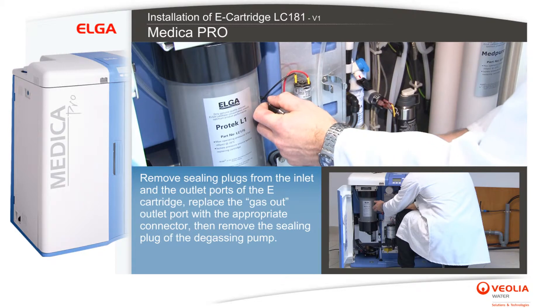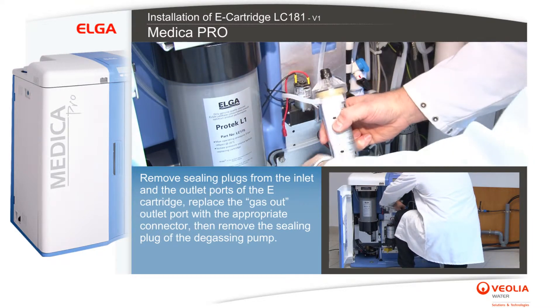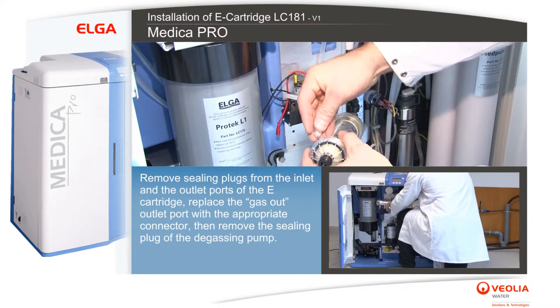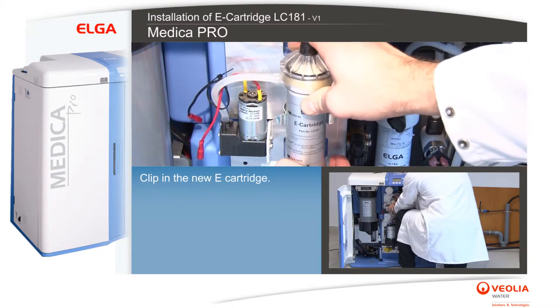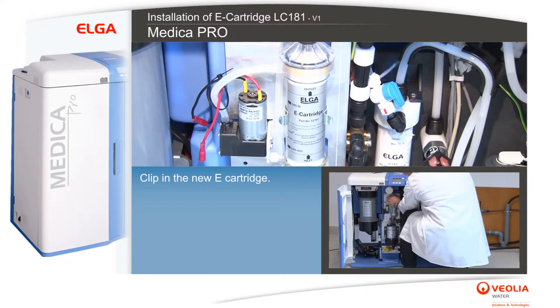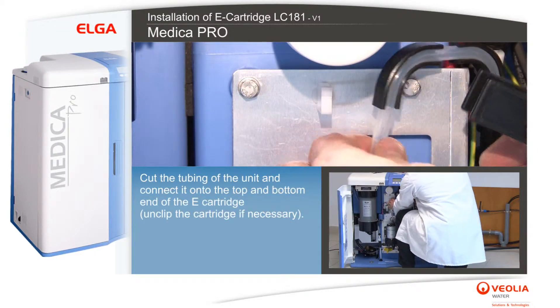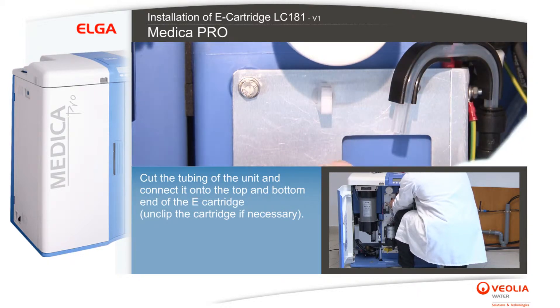Remove sealing plugs from the inlet and the outlet ports of the e-cartridge. Replace the gas out outlet port with the appropriate connector. Then remove the sealing plug of the degassing pump. Clip in the new e-cartridge, cut the tubing of the unit, and connect it onto the top and bottom end of the e-cartridge. Unclip the cartridge if necessary.